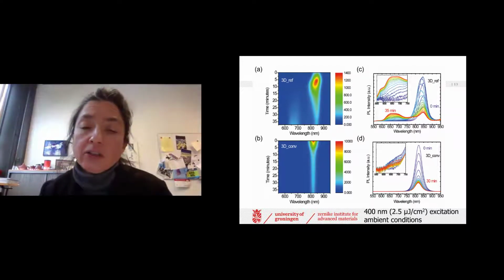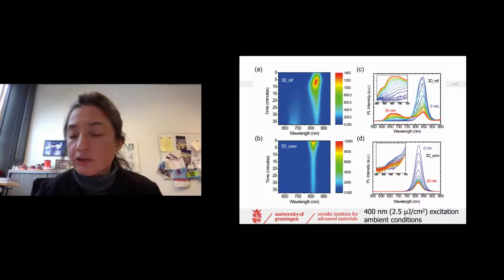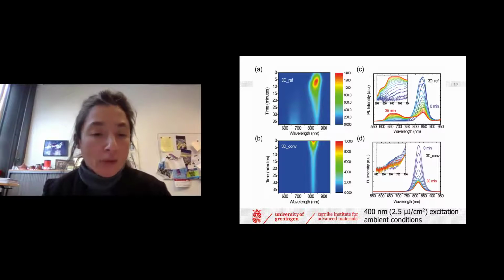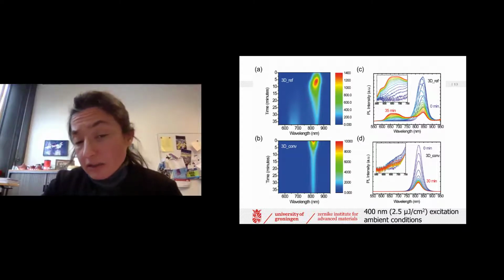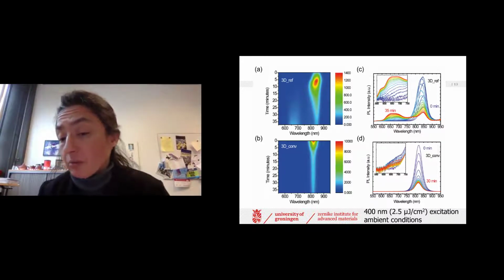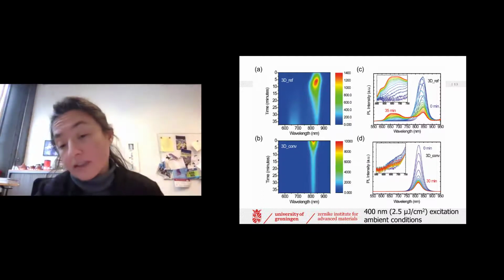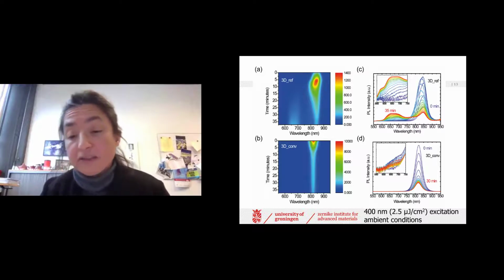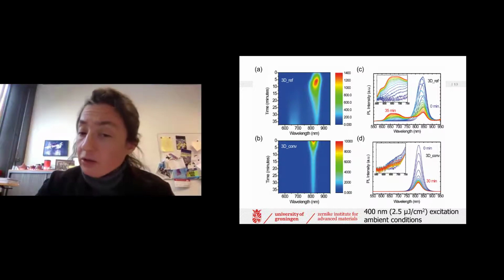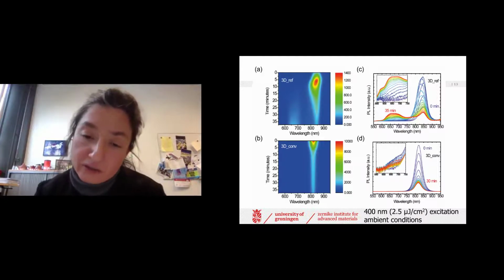And actually it is the indication that lead iodide is appearing as a decomposition product of our formamidinium lead triiodide. Instead, the converted samples, as we saw also visually, are much more stable. After 30 minutes of excitation in air, they decrease their photoluminescence intensity, but they only show a very minor signature of degradation with a decomposition peak around 600 nanometers.